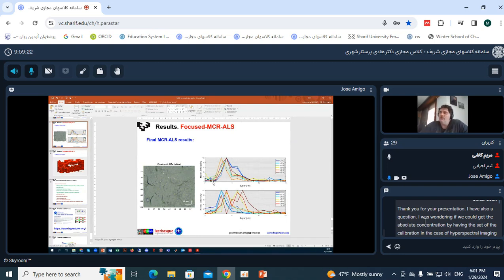Here I show you one example in which we found several plastics, but they were really well internalized, so there is no risk that it is us inducing that signal.